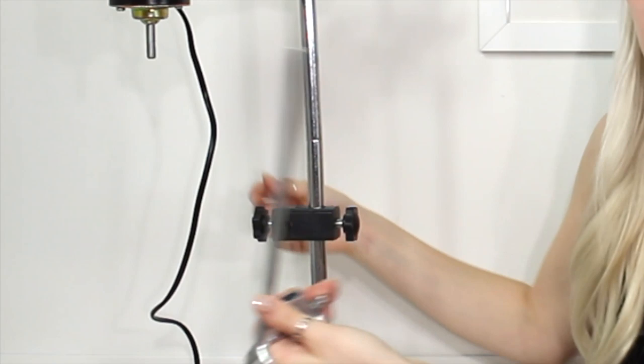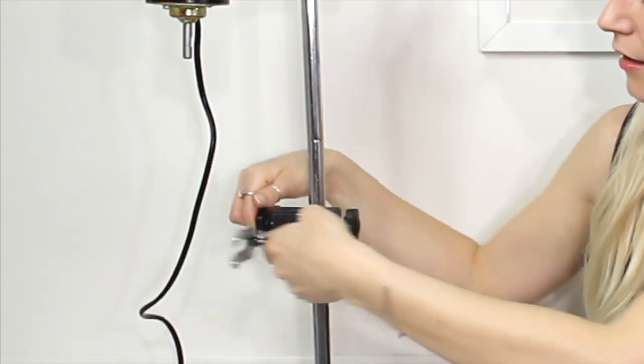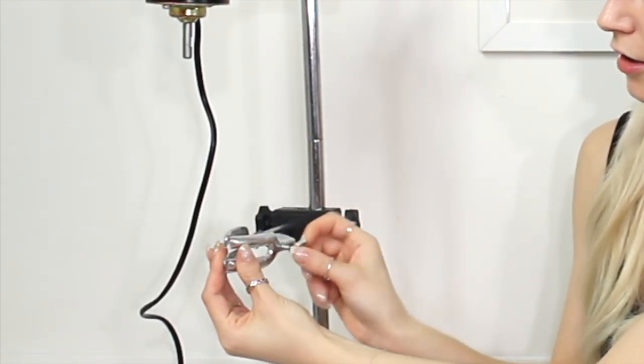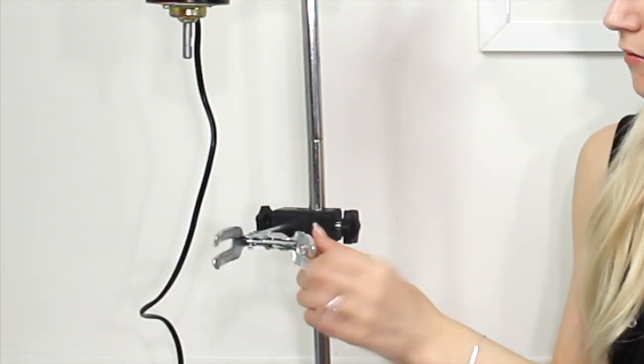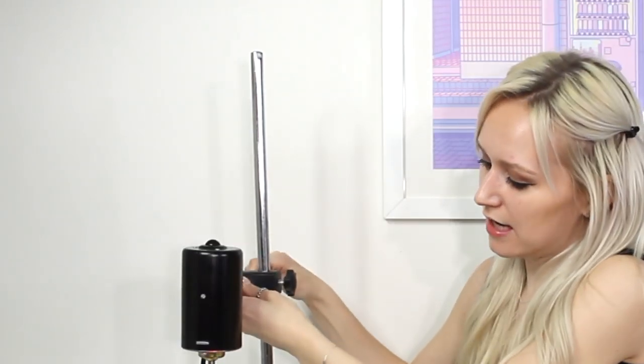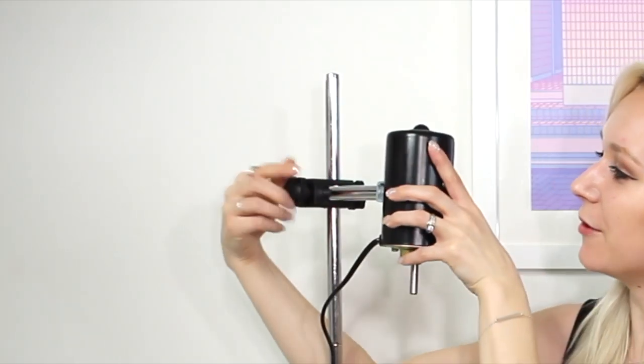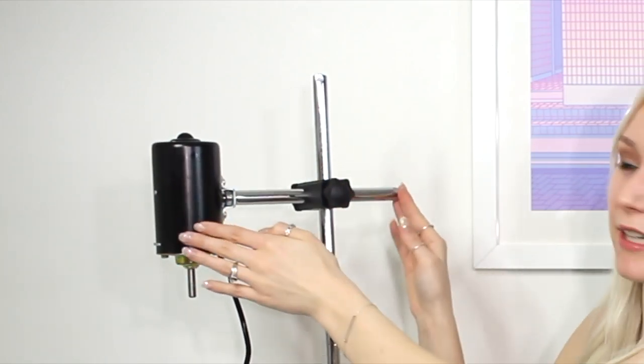The claw can come out — it just goes straight in and you tighten it. The claw can close by tightening here, and it can also get bigger. You can adjust it down by unscrewing. It honestly isn't the smoothest, but whatever — I only paid $60 for it, so you can't really expect much. This whole arm piece comes out easily. I actually put it together without directions; I didn't find the directions until I emptied the box and looked under the foam.